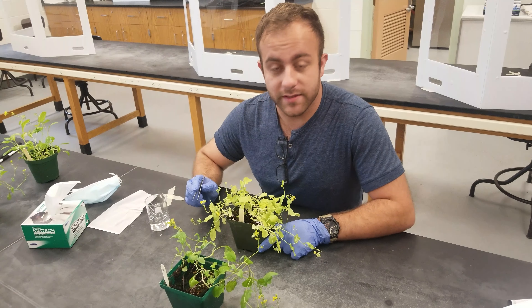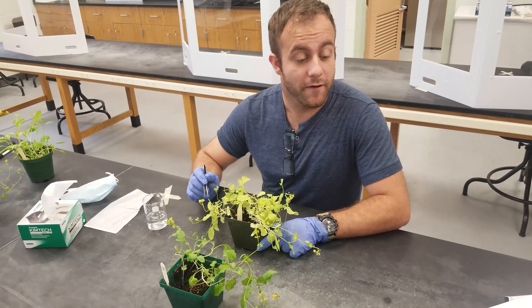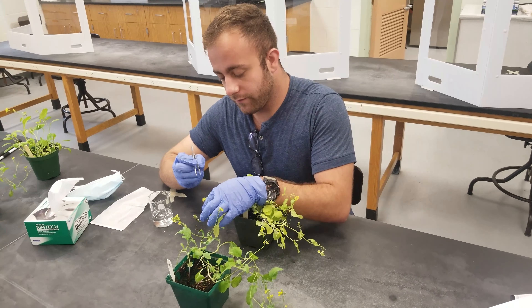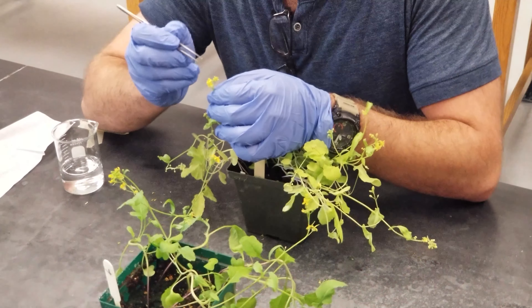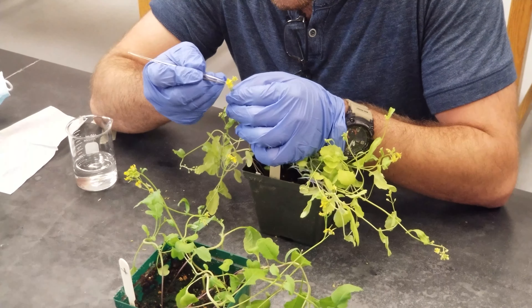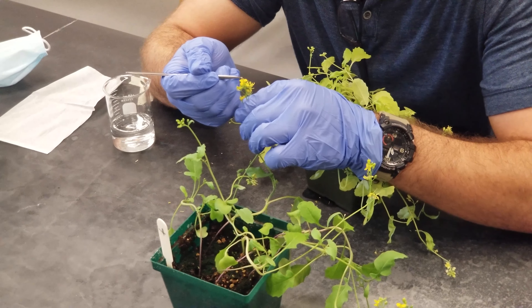Hello, in this video I want to demonstrate how to do reciprocal crosses for the plant Brassica Rapa. I'm going to remove the anther from the yellow Brassica Rapa to get the pollen, and then I'm going to take that anther and pollinate the pistil on the wild type flower.